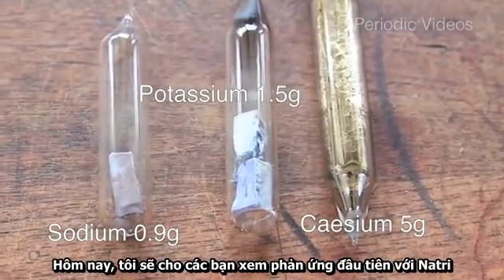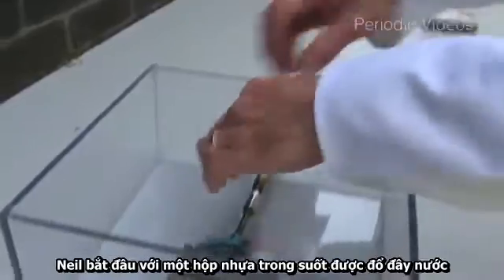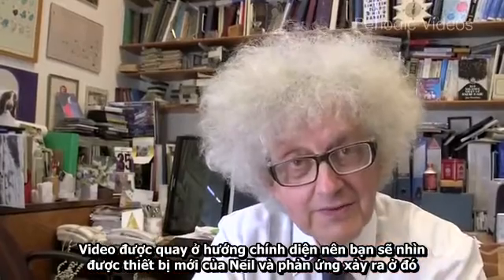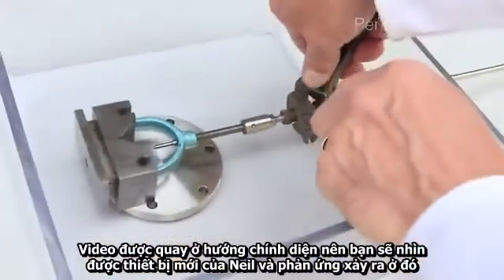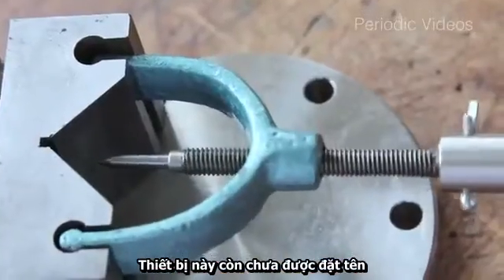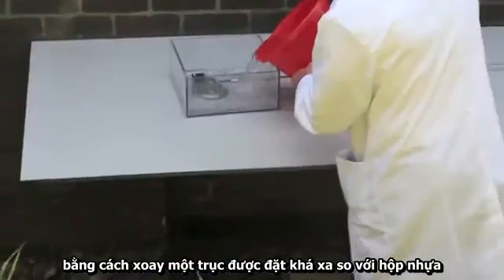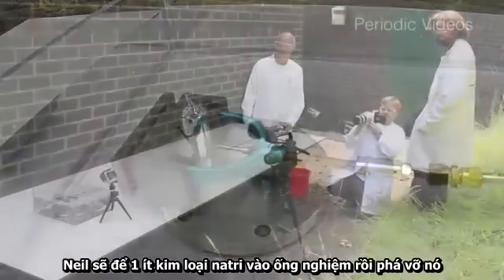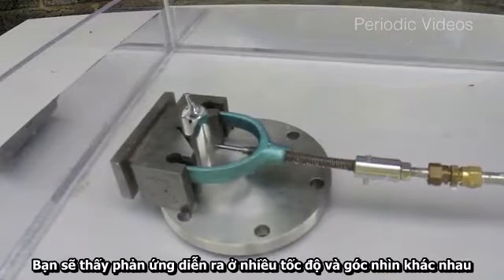Today I'm going to show you the first experiment, which was with sodium. Neil's device begins with a plastic box filled with water, with flat sides so you can video and see both under the water and what's happening on the surface. Inside is a device — a sort of thumb screw for test tubes — where by turning a shaft from far away, he can force a metal pin into the side of a test tube so that it breaks. You can film the whole thing at different speeds and from different angles.